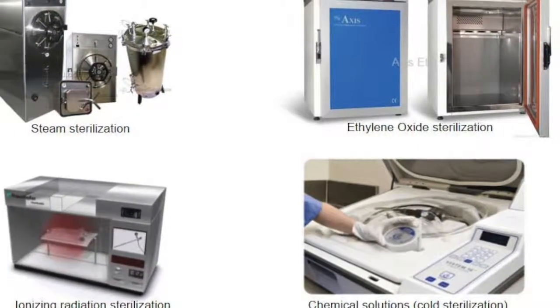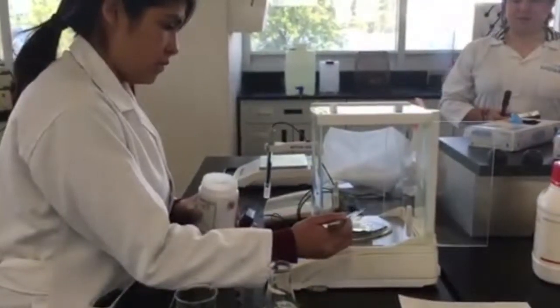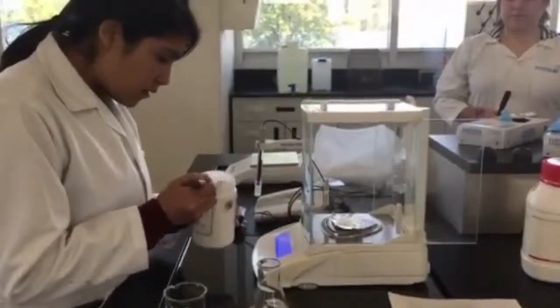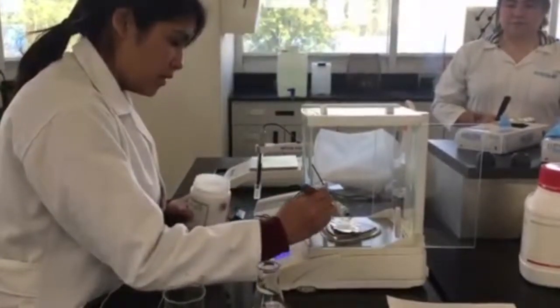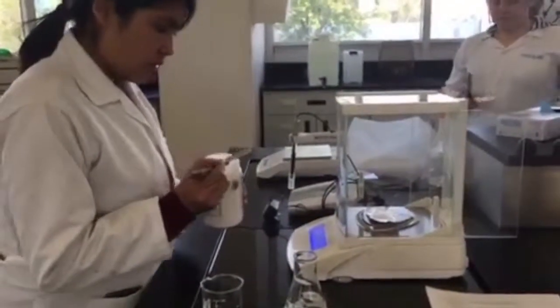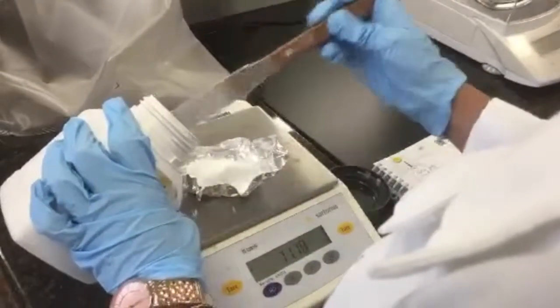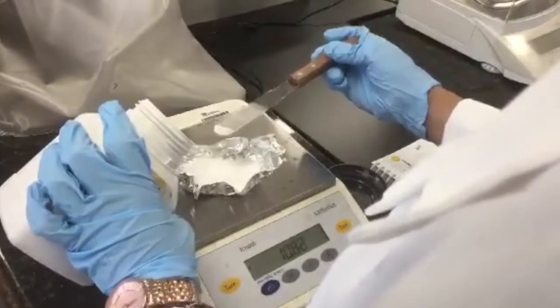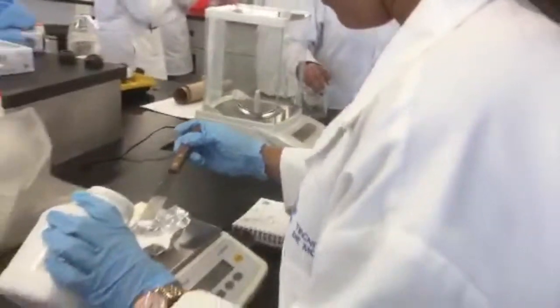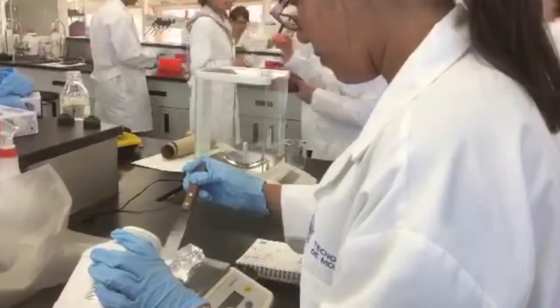Also, we want to talk about sterilization types. We are going to focus on 4. 1. Steam sterilization, which works to sterilize materials tolerating high temperatures. It's fast and easy to control. 2. The ethylene oxide sterilization. When mixed with an inert gas, it produces effective sterilization by destruction of DNA and protein structure of microorganisms. 3. Ionizing radiation sterilization. They are used in the medical supply industry. They are characterized by high energy and high penetration. 4. Chemical solutions. Cold sterilization, consisting of immersing instruments in high-level disinfectants, and allowing the sterilization of thermosensitive materials.